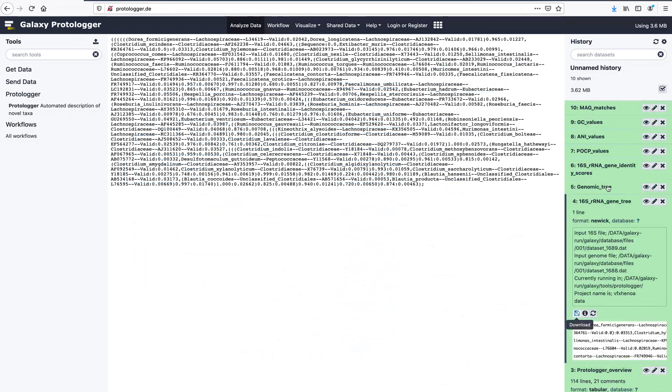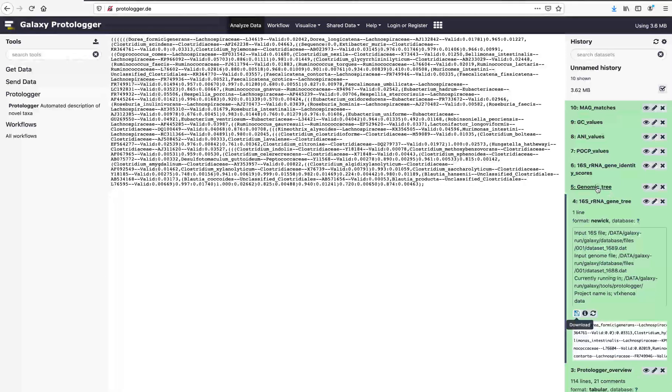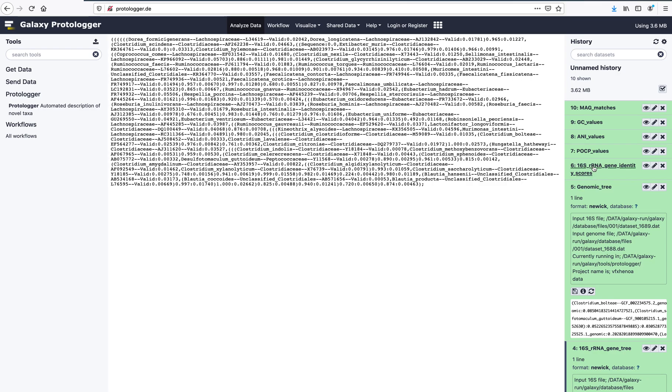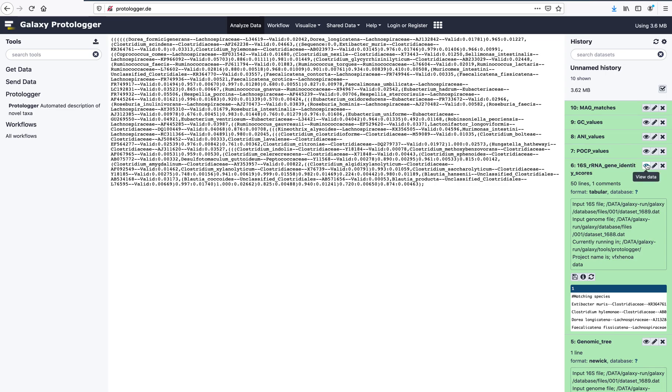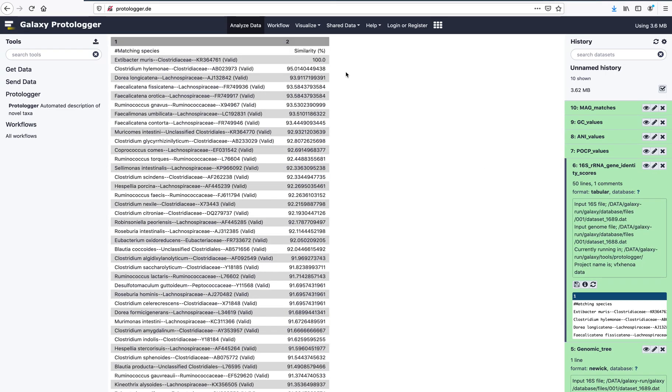Protologa also produces a genomic tree which includes all close relatives for which genomes are available. The 16S rRNA gene identity scores file provides the pairwise comparison of the input 16S rRNA gene to the most similar 50 species, and states if species are validly named or not, based on the DSMZ nomenclature list.